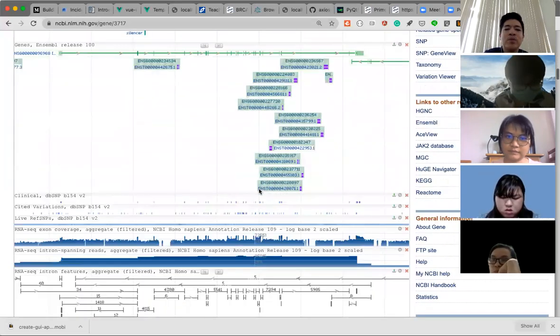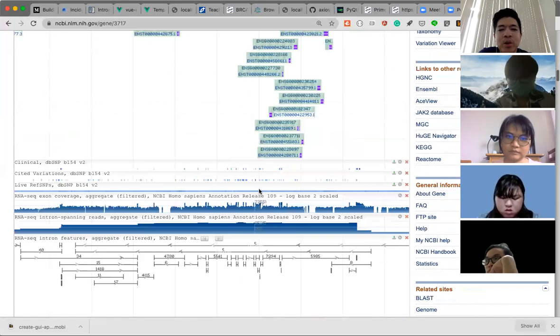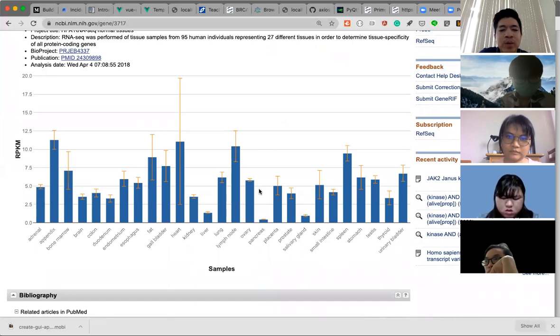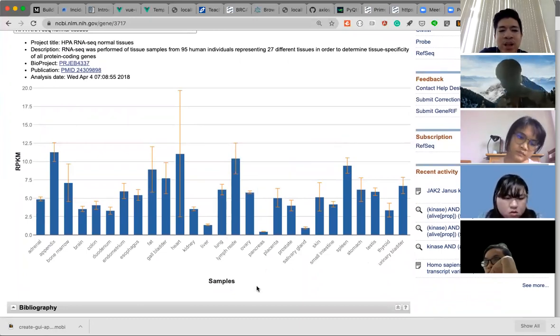Okay, so that's a lot more information, and we're not going to go over all of this stuff because I think it would be good for you to play with it yourself. And this one is the result from the RNA sequencing using next-gen sequencing data.